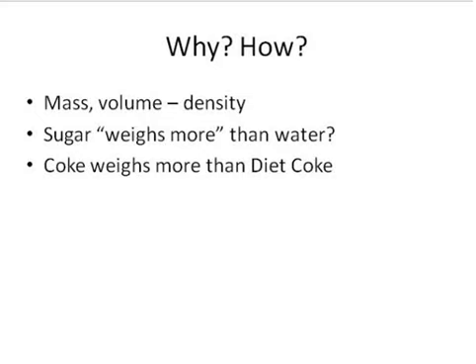And so density is an interesting property because it can be transferred from one type of measurement system to another. So presumably if you measure the density of Coke and I measure the density of Coke, even though we didn't do it on the same amount of Coke in the same place at the same time, we should end up with the same answer. So intensive properties turn out to be fairly useful. So you will be measuring mass using a balance, and you'll be measuring volume using a volumetric flask, and I'll have a little bit more to say about that as we go along when I get to the procedure section.